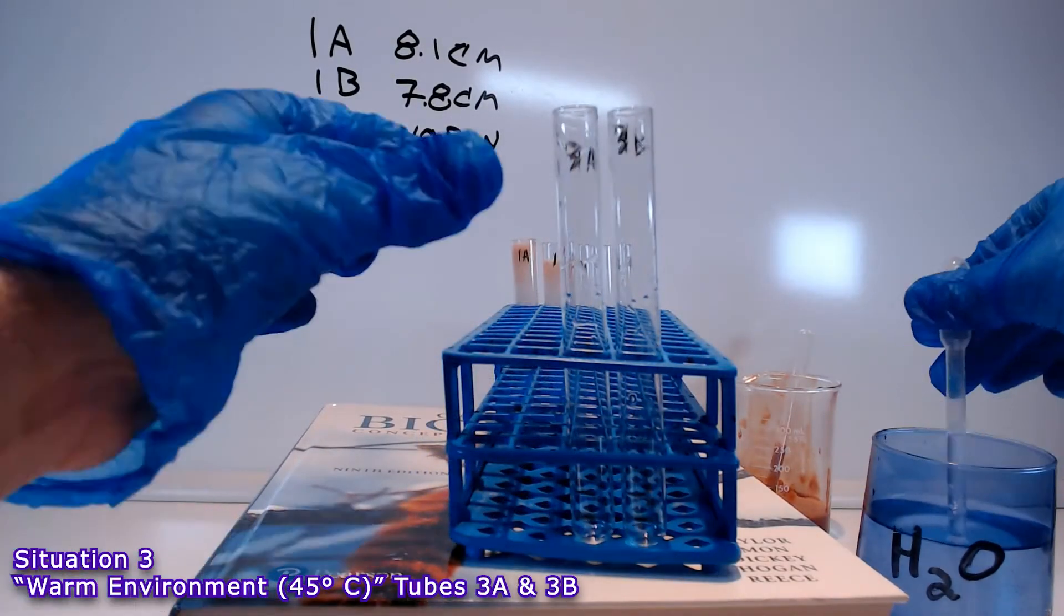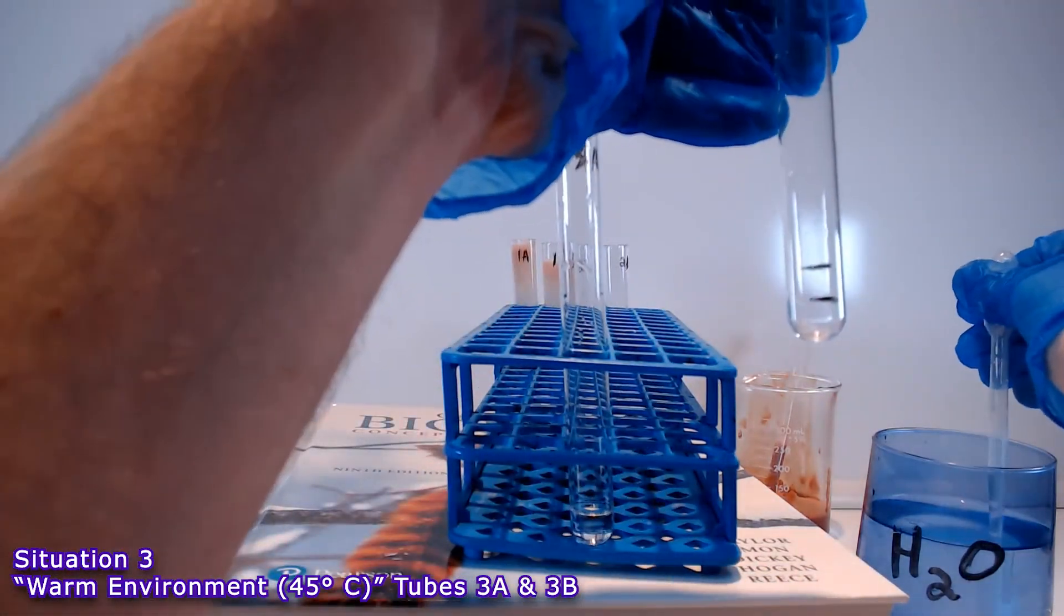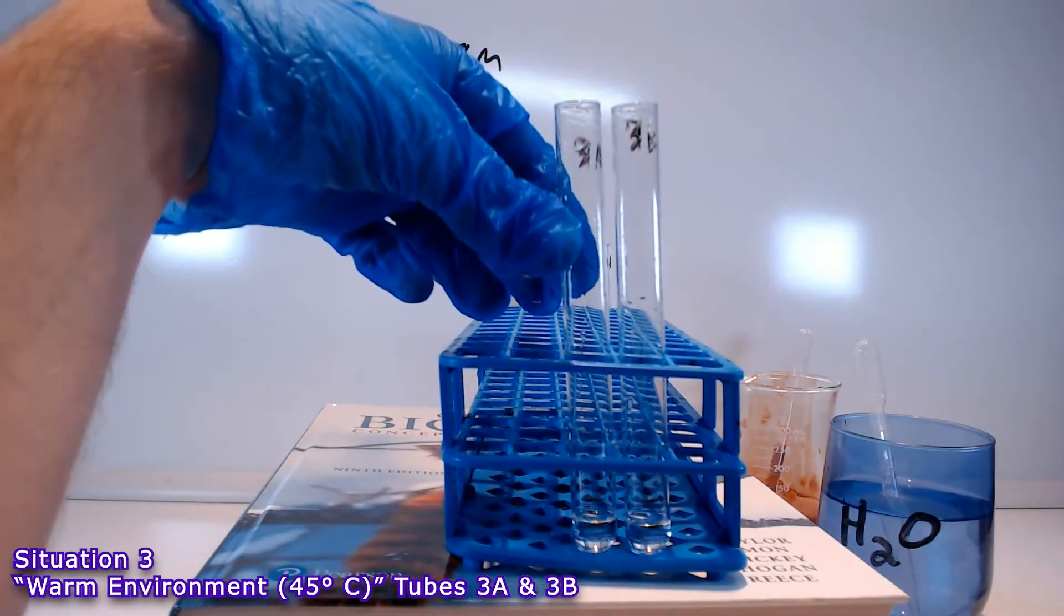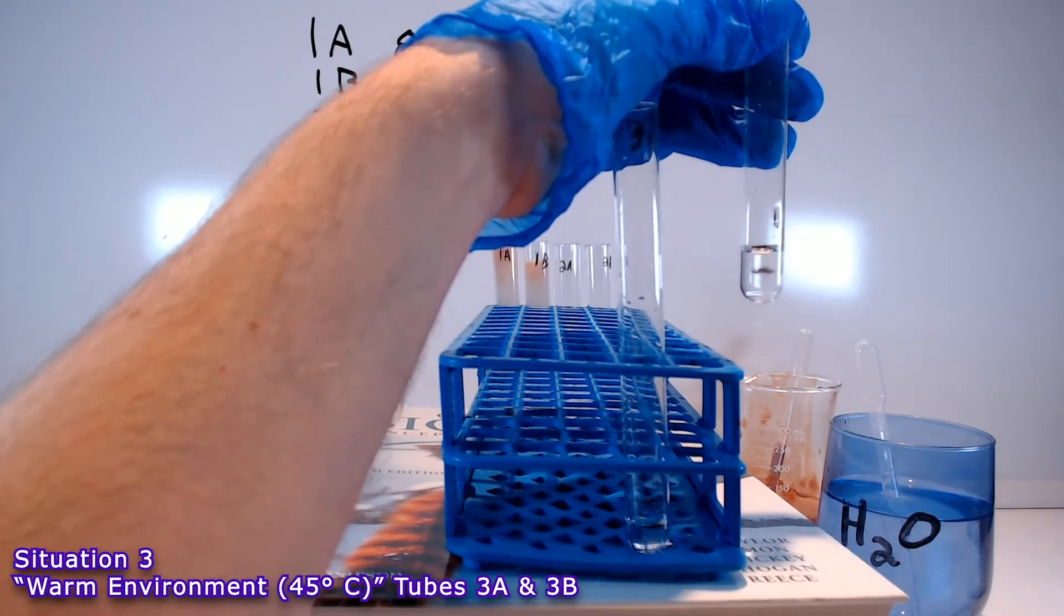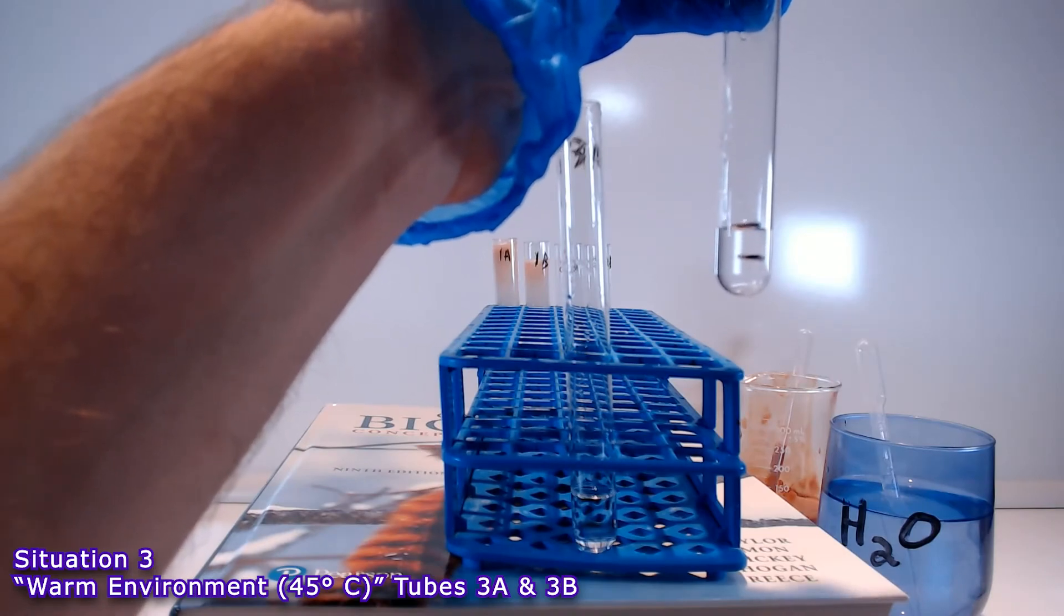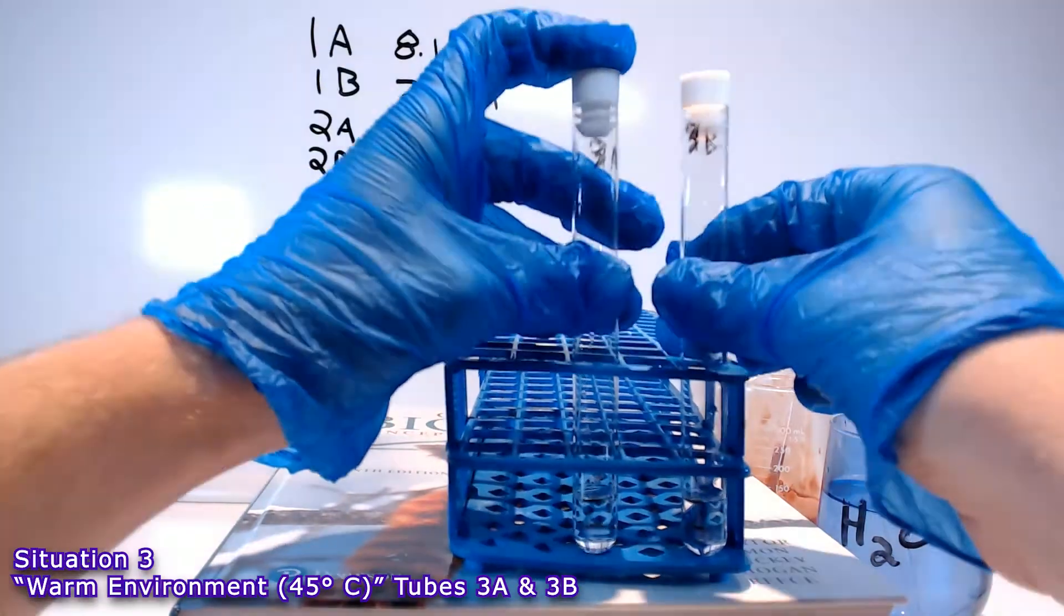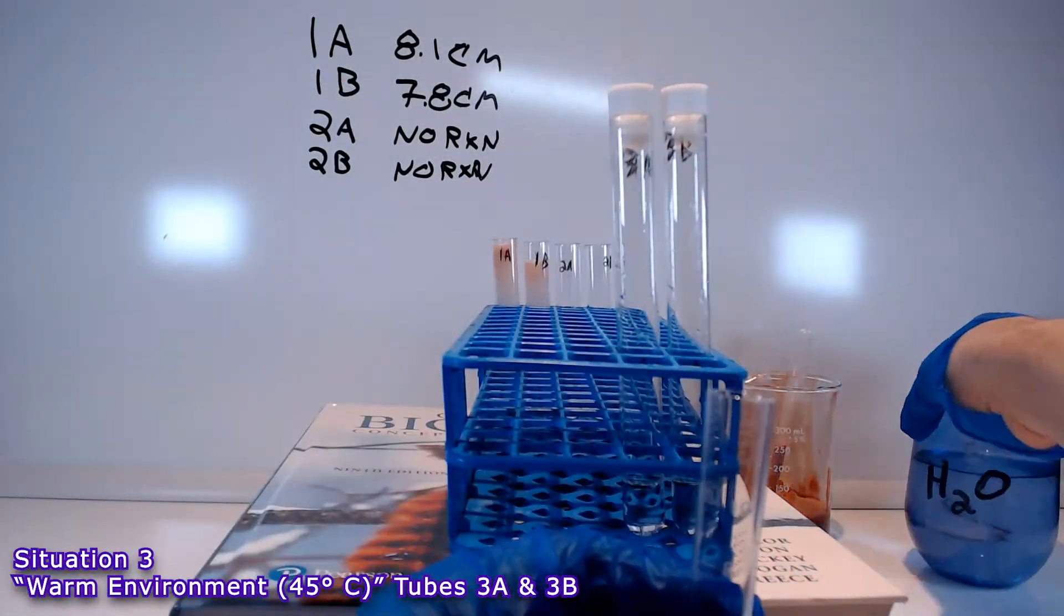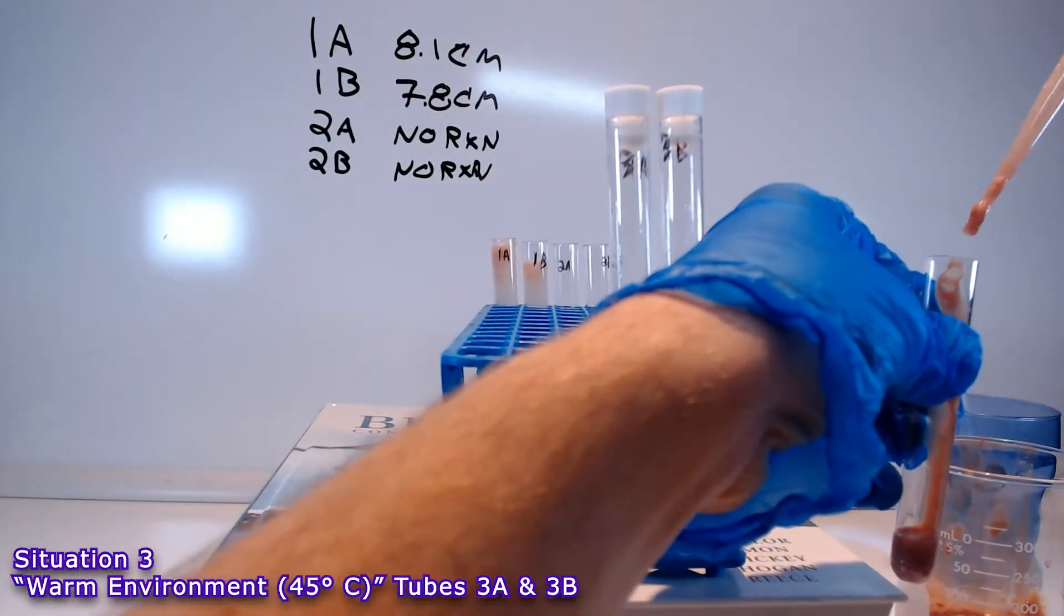In situation 3, the setup is relatively the same as in situation 1. We are going to add water to the 1 centimeter mark and hydrogen peroxide up to the 2 centimeter mark. The key difference is the temperature. Situation 1 was room temperature. But, for situation 3, we are going to heat up the hydrogen peroxide solution. We are also going to heat up the liver homogenate.